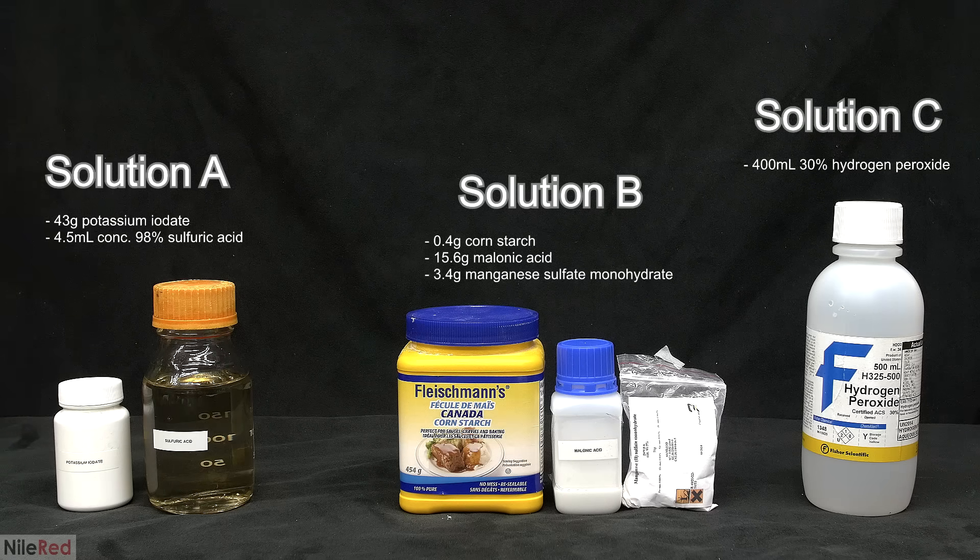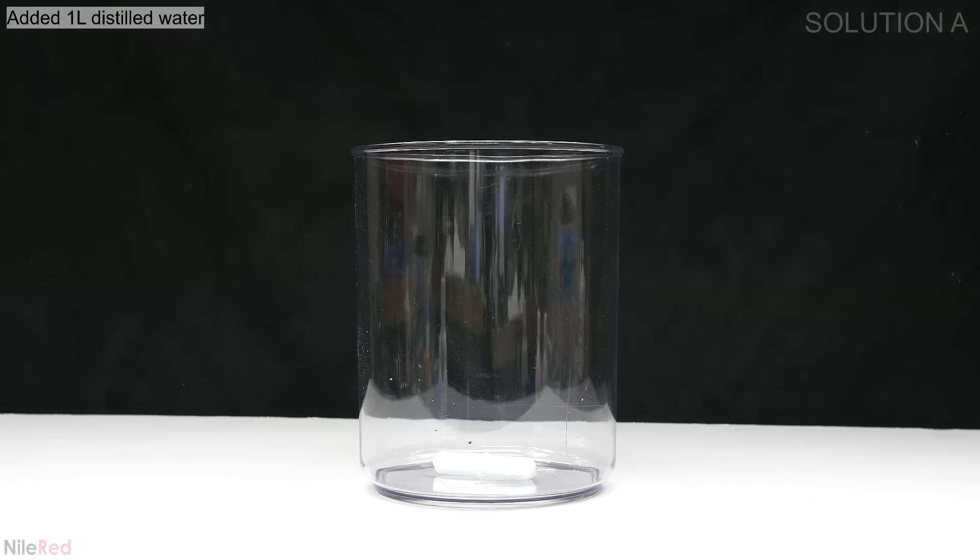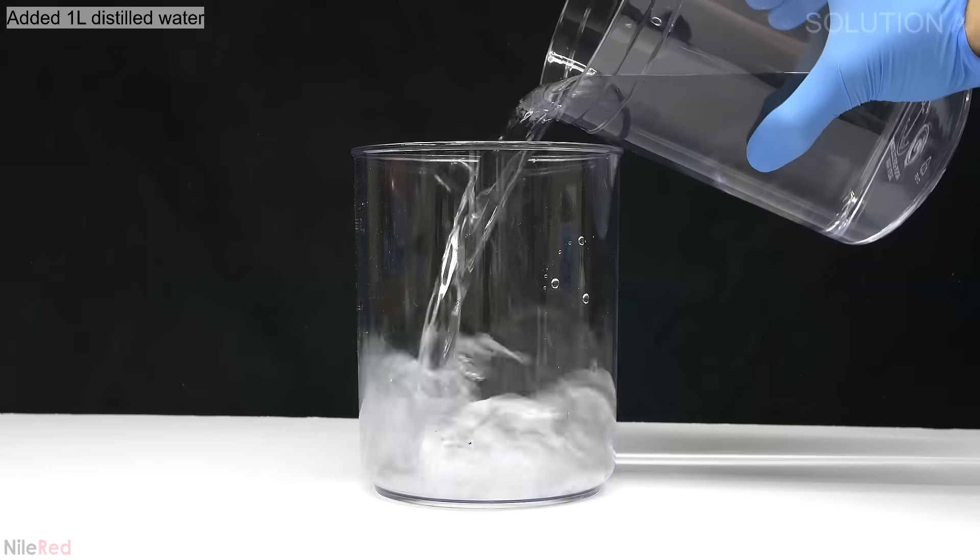I'm going to be making one liter of each solution but the quantities can easily be scaled to any volume. For example, if you instead want to make 100 milliliters of each you can just divide everything by 10. Now I need to make the solutions and I'm going to start with solution A. Into a plastic container I add about one liter of distilled water.